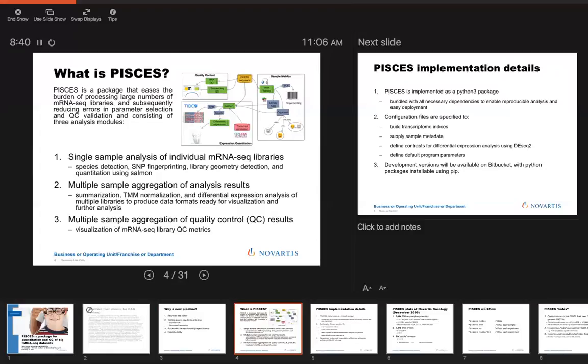They might be strand-specific, or they might not be. They might have poly-A selection, or they might not. We might not even know what species the data are supposed to be, although hopefully we've kept good enough records so that we know they're human or mouse. But in certain cases, we're pulling in data from collaborators, and they haven't kept very good records. So we don't want to trust that these are all human samples. They might be mouse, or a special case, xenografts, which we have quite a few of.